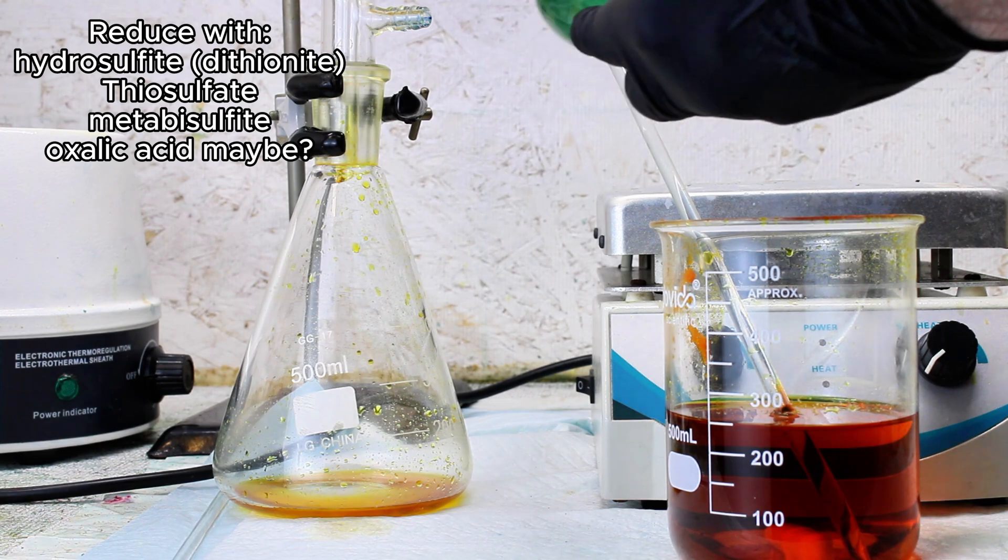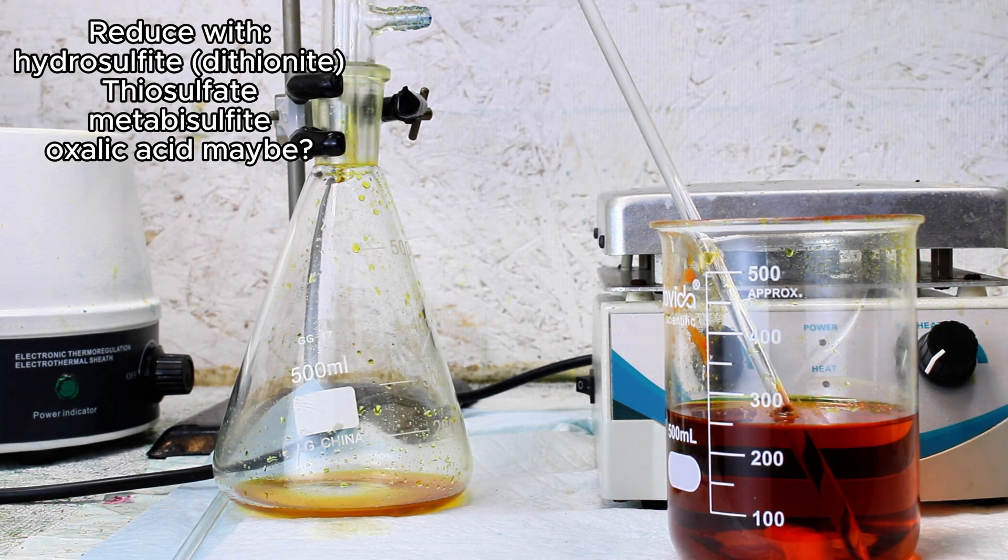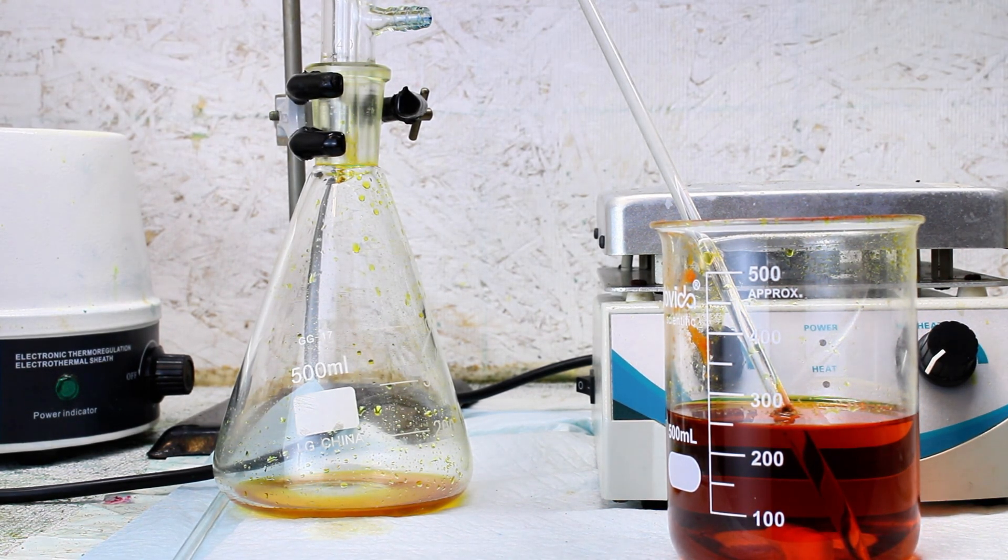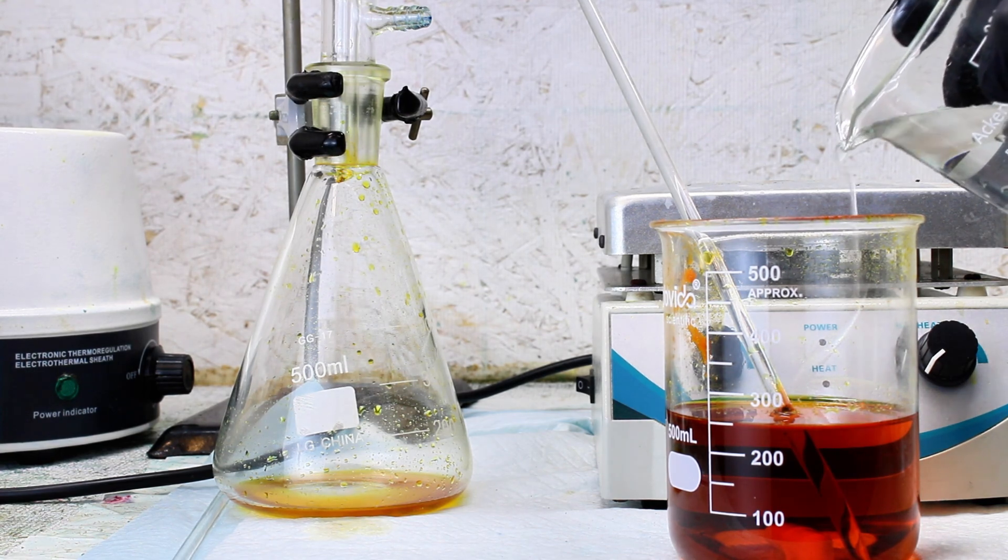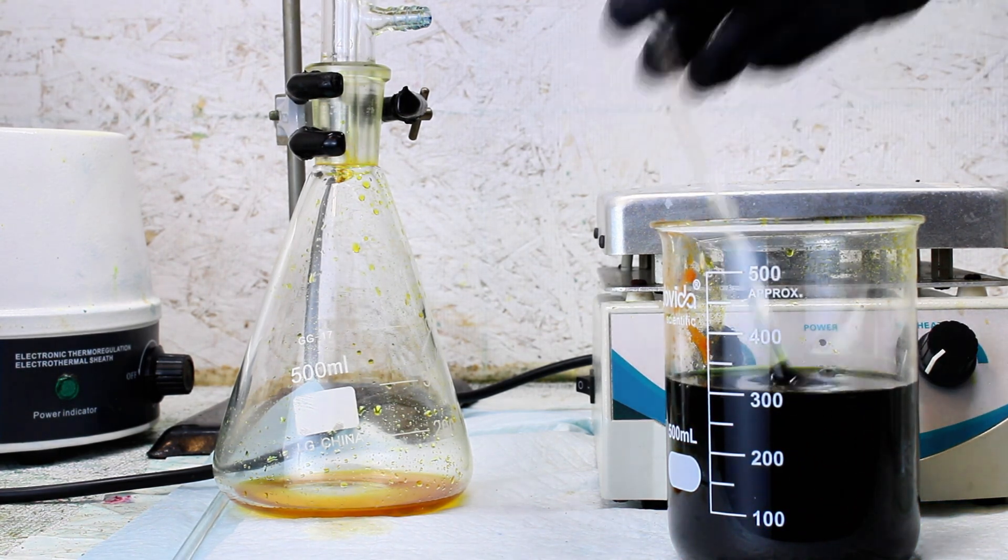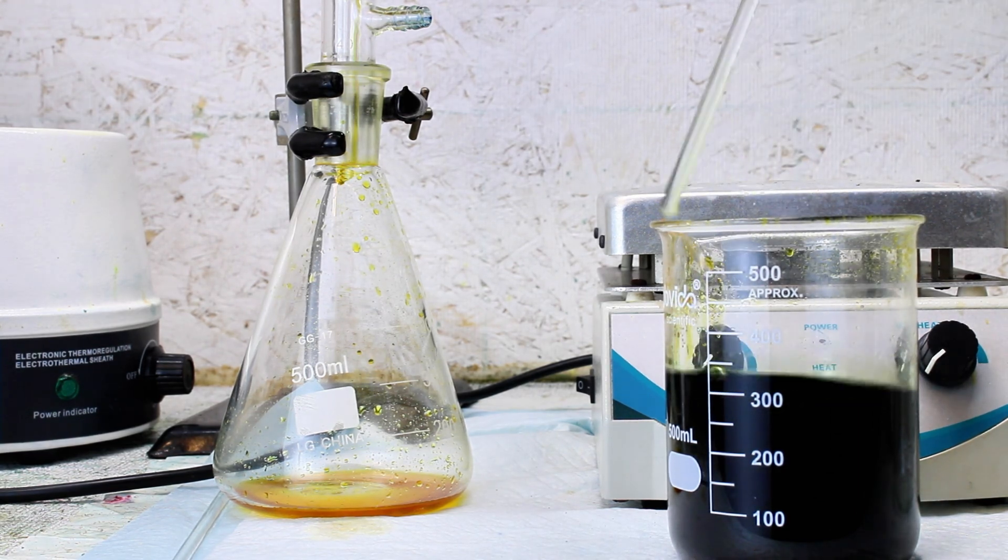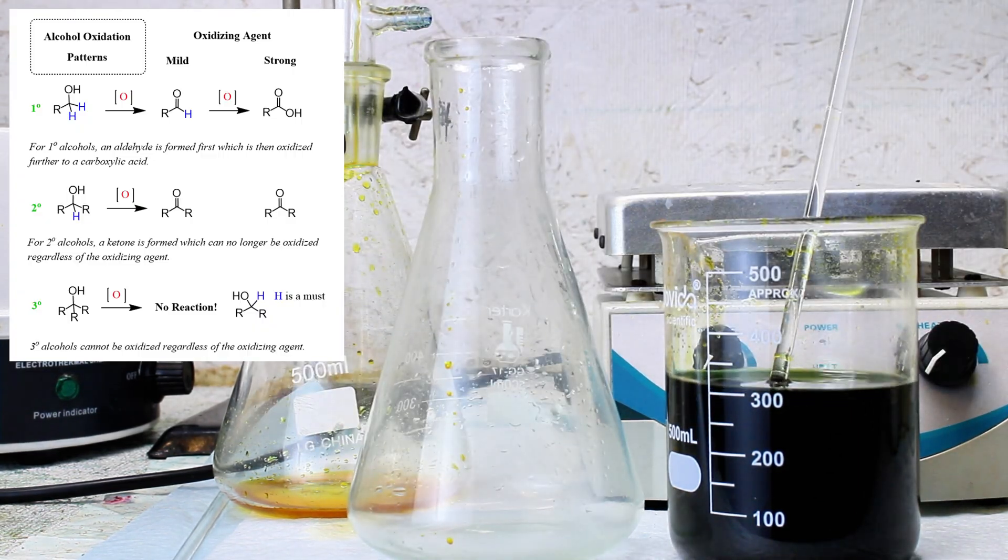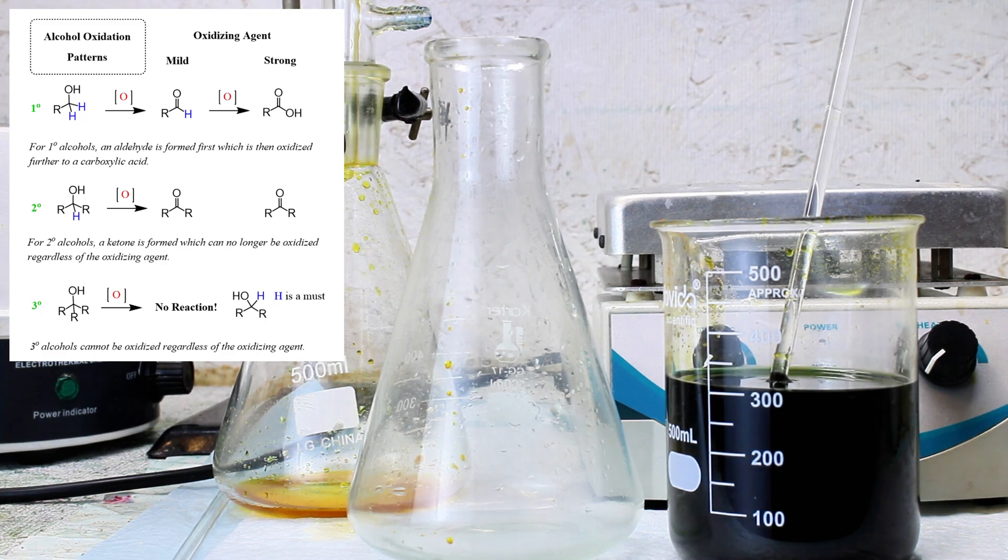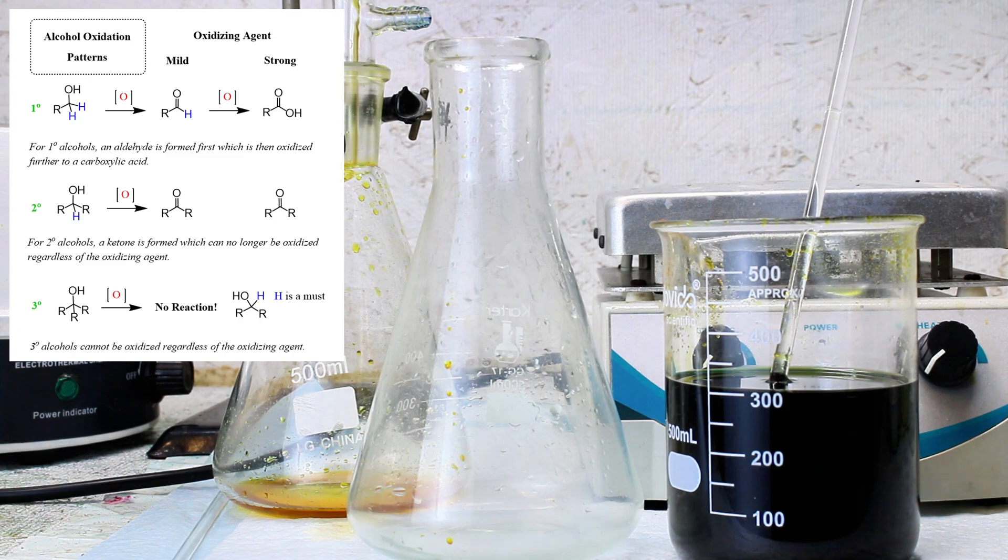Now a bit about this chemical itself. All hexavalent chromium compounds are decently strong oxidizers and frequently used in organic synthesis as a milder alternative to permanganate. For example, I've used dichromate to oxidize primary alcohols to aldehydes or secondary alcohols to ketones, while permanganate typically only produces carboxylic acids.